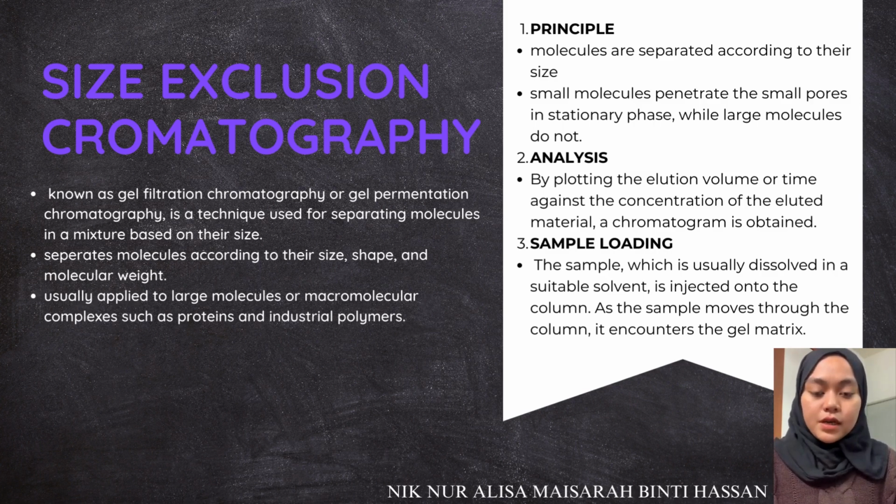First, principles. Molecules are separated according to their size. Small molecules penetrate the small pores in the stationary phase, while large molecules do not. Second, analysis. By plotting the elution volume or time against the concentration of eluted material, a chromatogram is obtained.